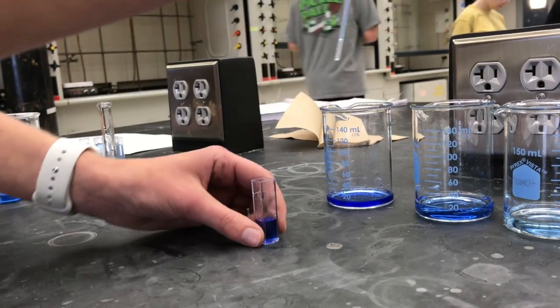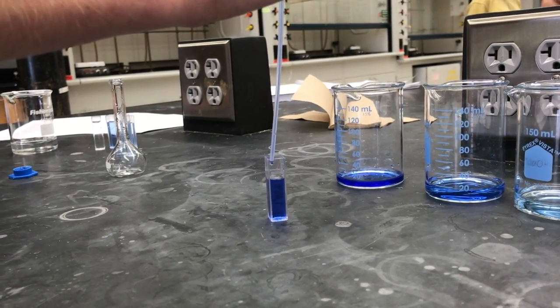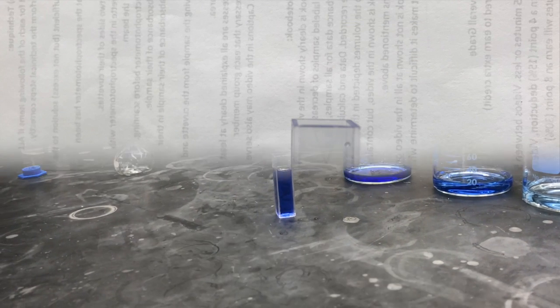You will do this for your stock solution and each of your dilutions, as well as fill up another cuvette with ammonia to serve as your blank. When filling these up, you want the meniscus to read just below the arrow mark as shown above.